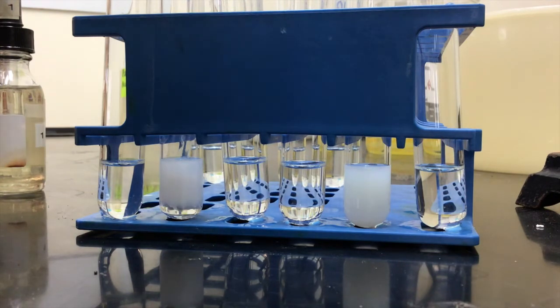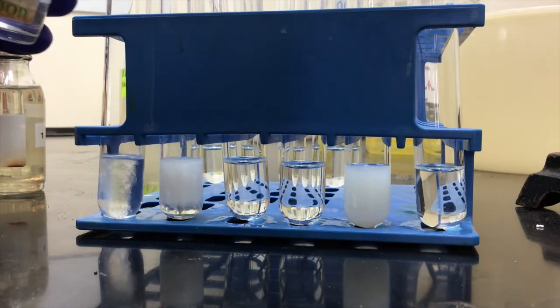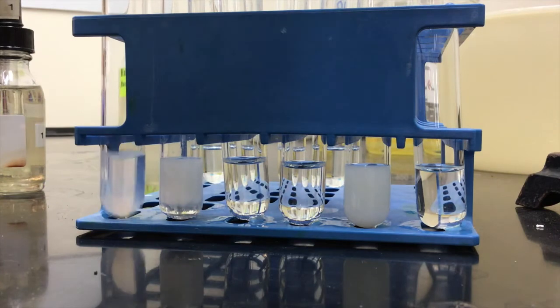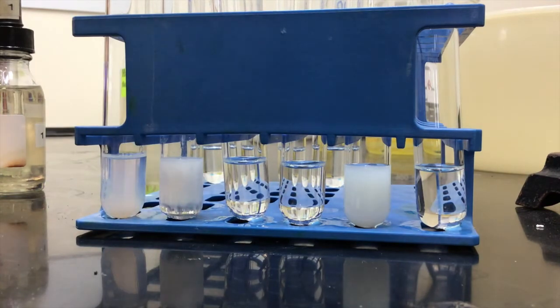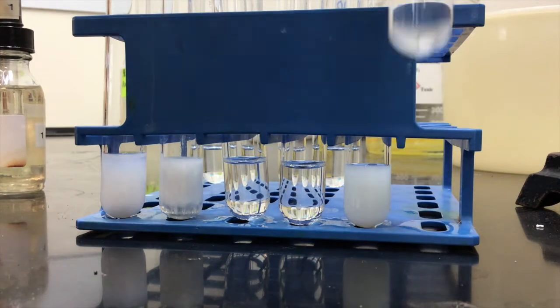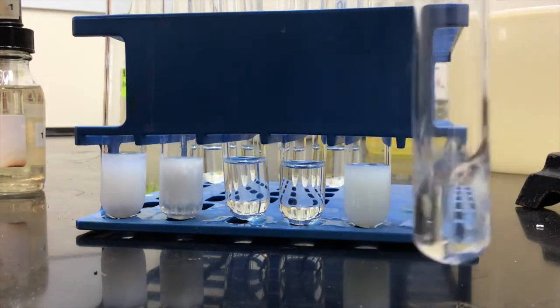Crotyl chloride for number 6. 1, 2, 3, 4, 5, 6. Whoa, simmer down there. Oh, okay. So benzyl chloride. Well, before we move on to benzyl chloride, because that's number 7, that's on the back, we're going to take a look at these again. A little shaky shake.